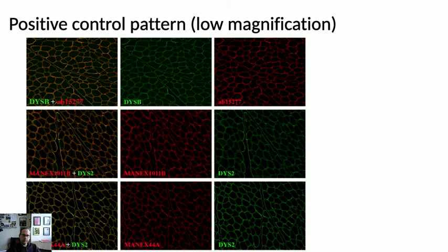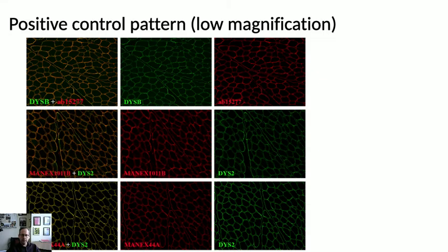When we did immunofluorescence on the samples, we noted a couple of different patterns. The positive control pattern — what it looks like normally — shows good positive staining at around the edges of each muscle fiber using different antibodies in green and red. There's a clear signal on both green and red channels, and when you overlay them in immunofluorescence the green and red together gives a good yellow signal rather than separate patches of green or red.